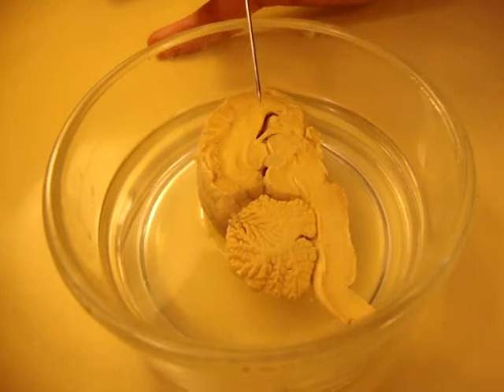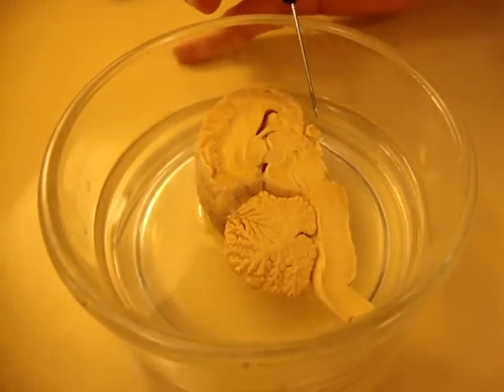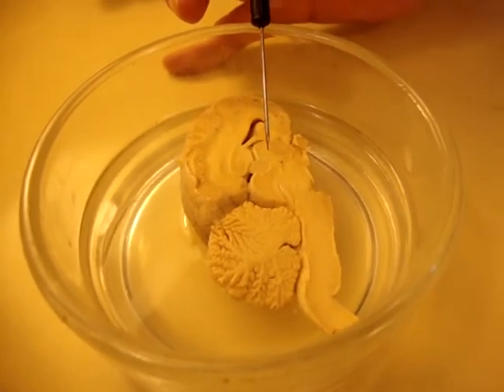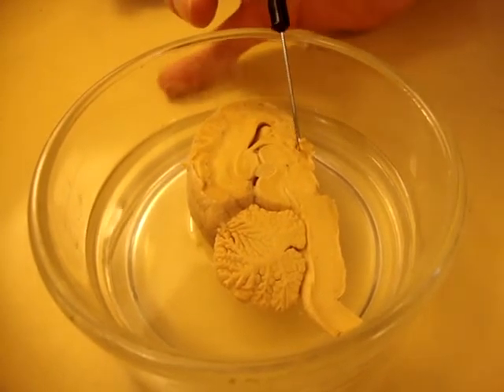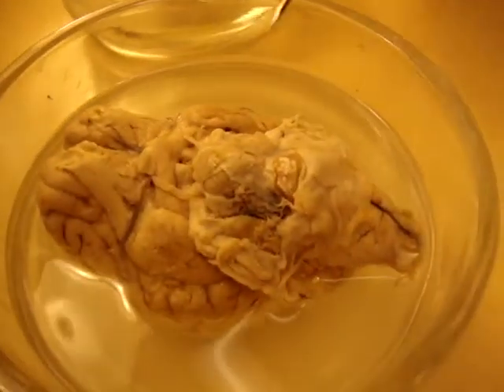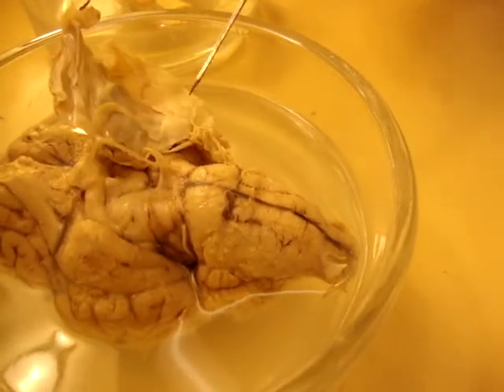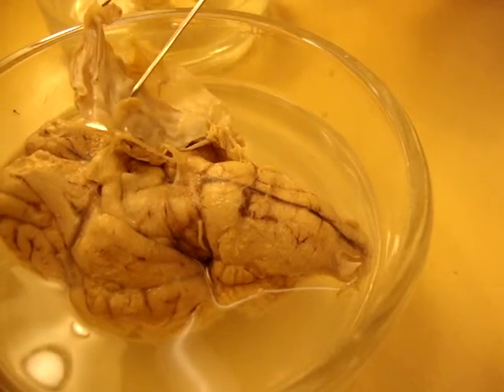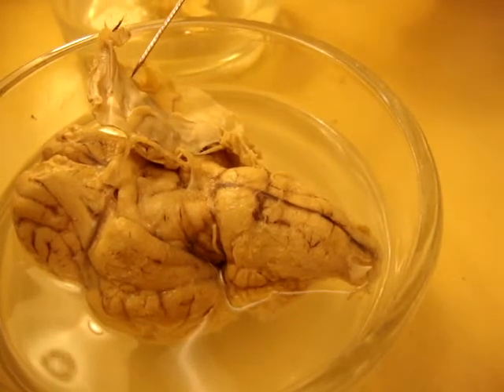So now we're into the diencephalon, still forebrain. So, optic chiasma. This is the thalamus. There are two sides to it. This area here is the hypothalamus, and the pituitary is not on here. It gets cut off. So the pituitary is actually this whole thing here. These are the posterior pituitary, or the neurohypophysis, these two little guys.